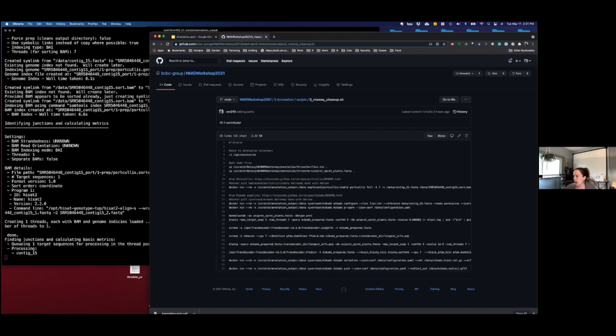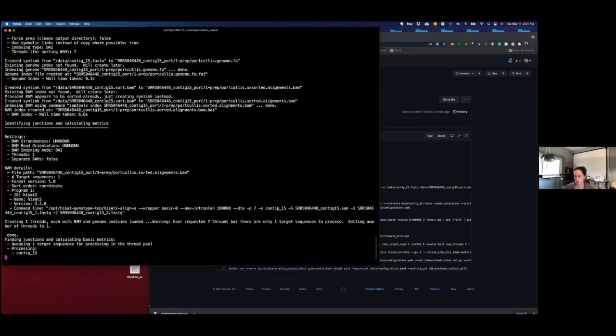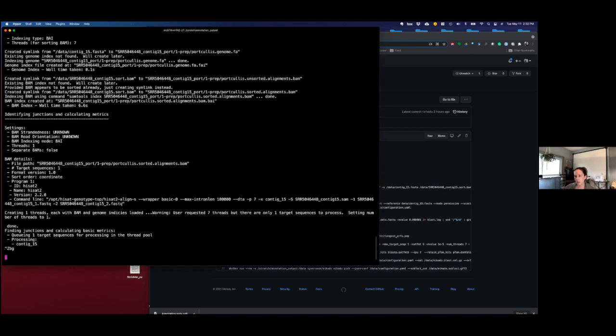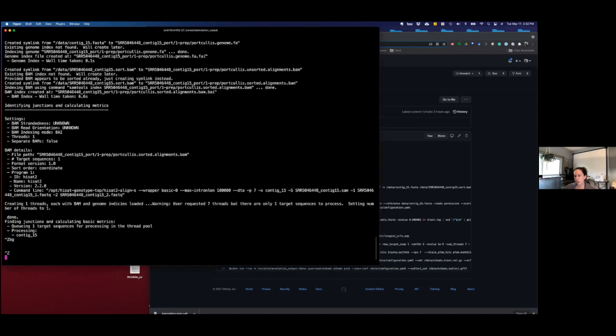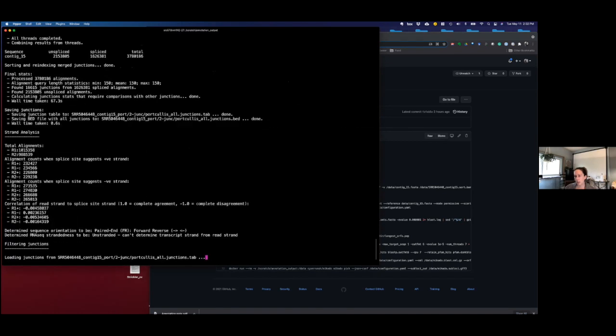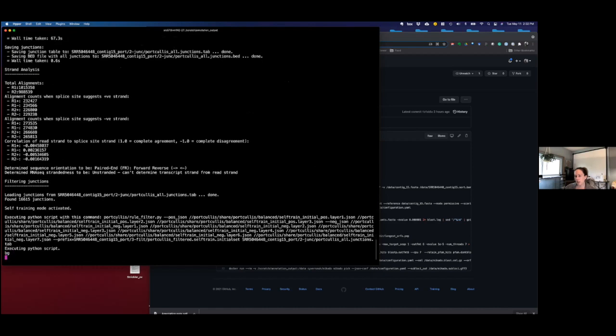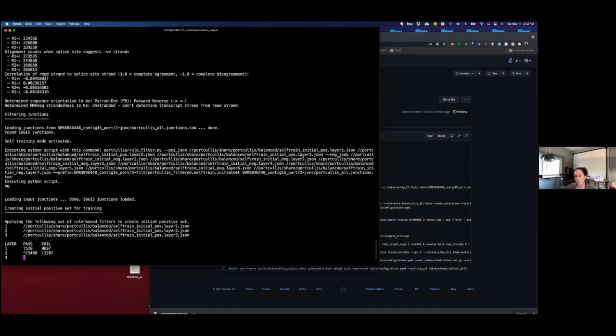So the next thing that's going to happen is we run Mikado. So Mikado is going to take the output from Portcullis. And I think in this case, we also use the StringTie output. Let's just look real quick. See if I can put this in the background. Doesn't seem happy with me. I might have to kill it. I'm killing it. Bye-bye.